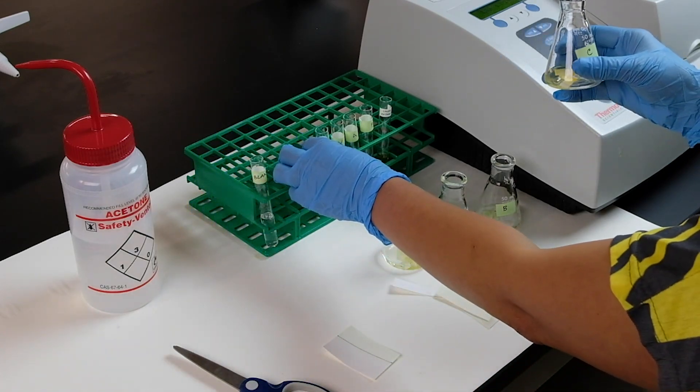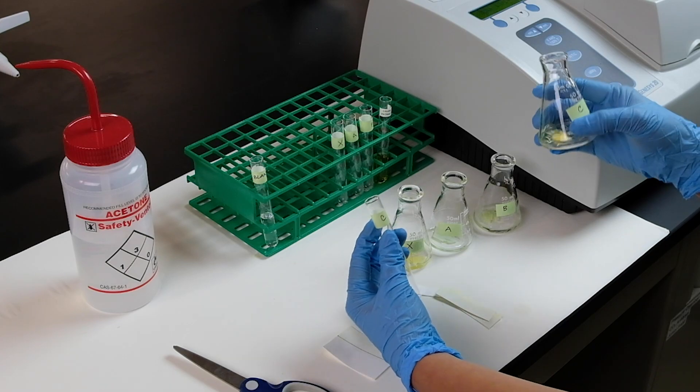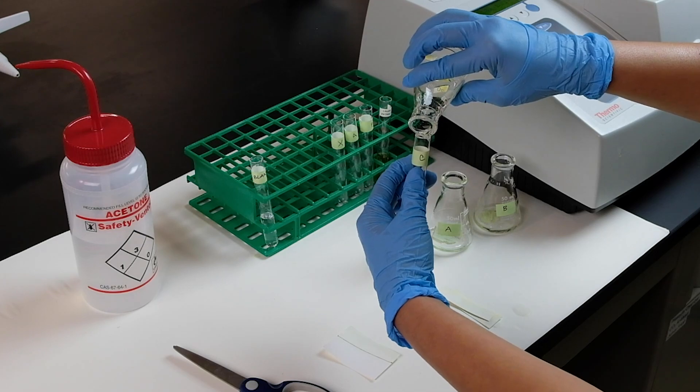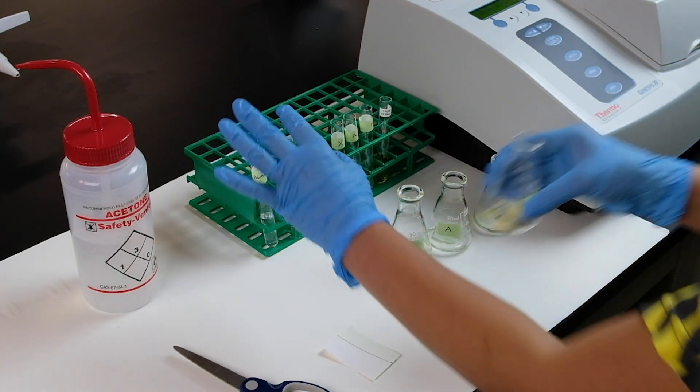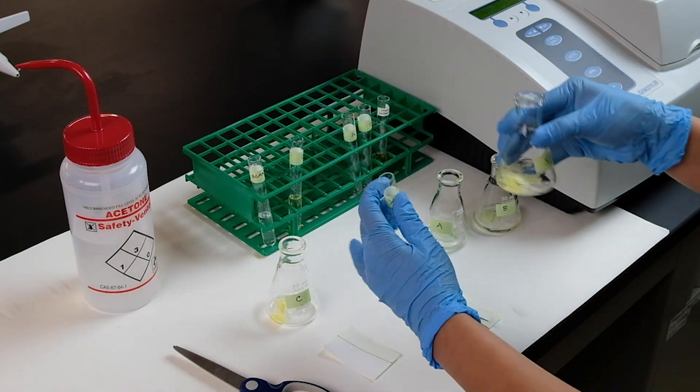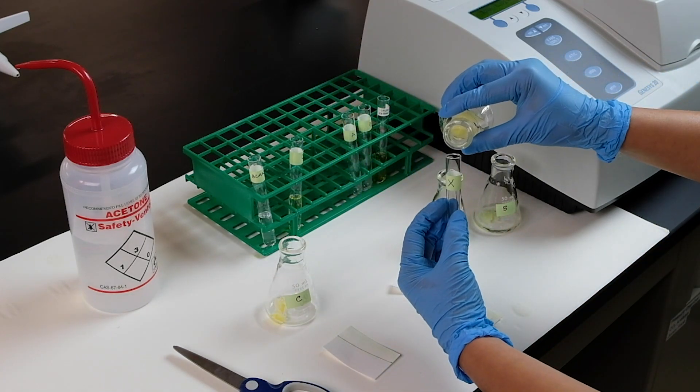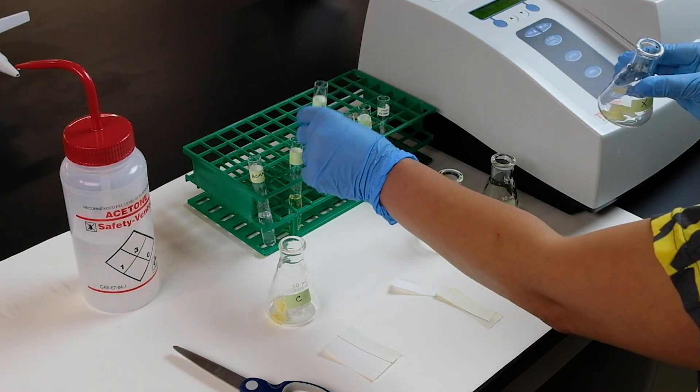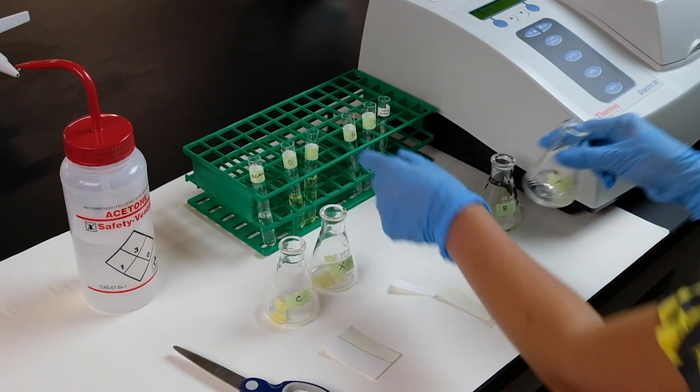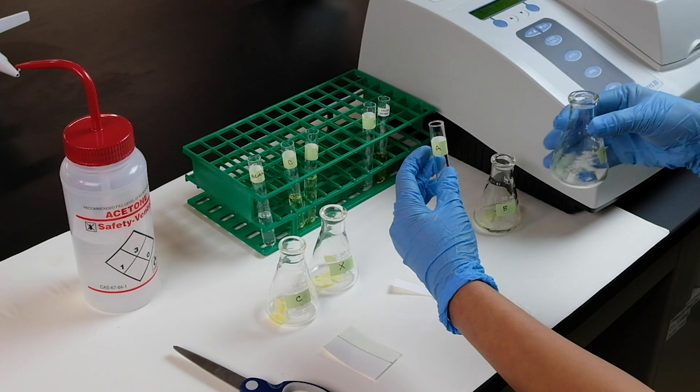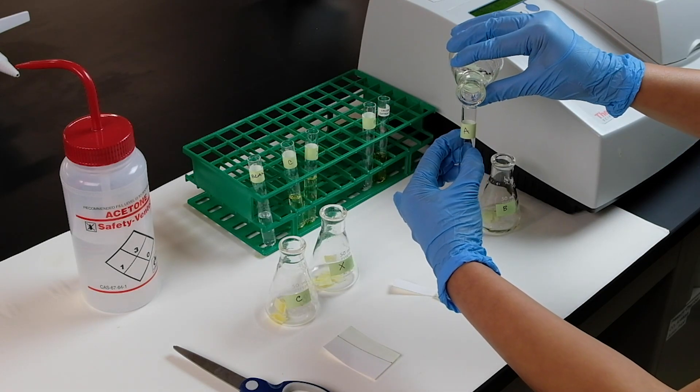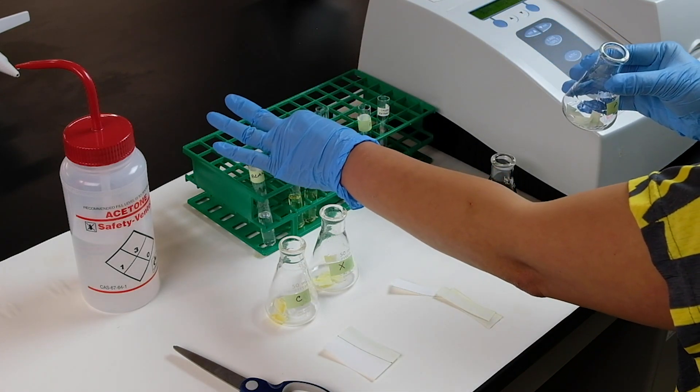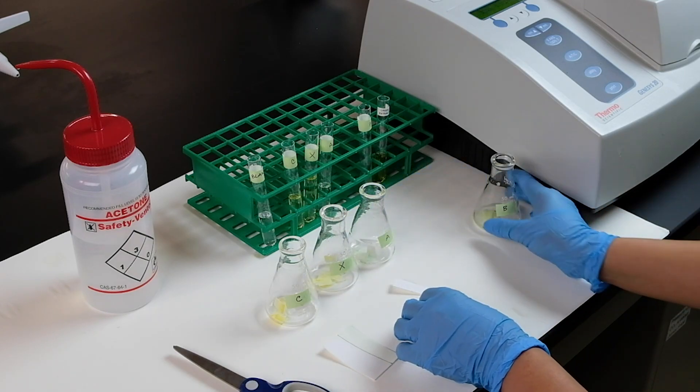Pour each pigment into the corresponding test tube: carotene to carotene, xanthophyll to xanthophyll, chlorophyll A, and chlorophyll B.